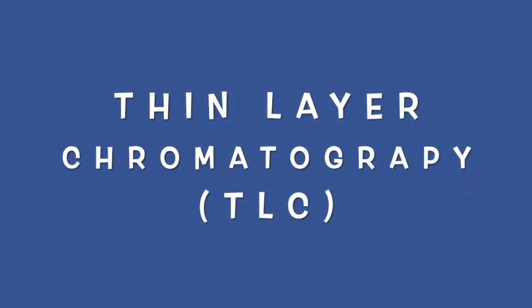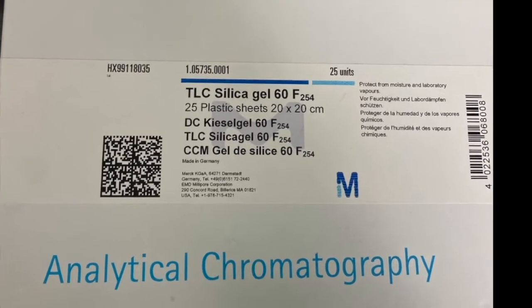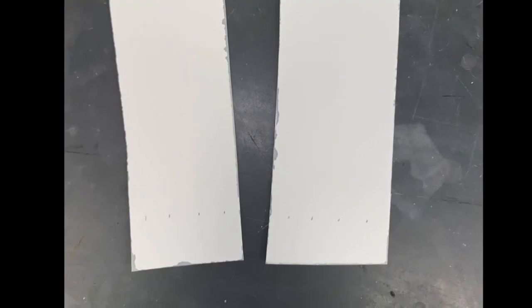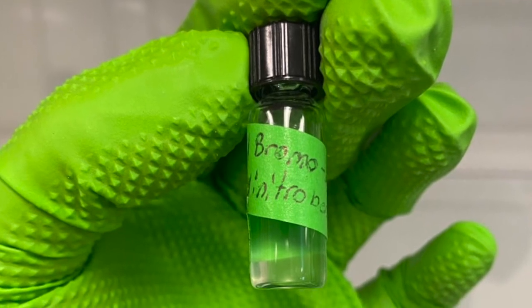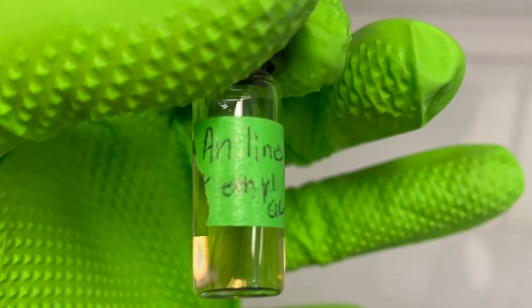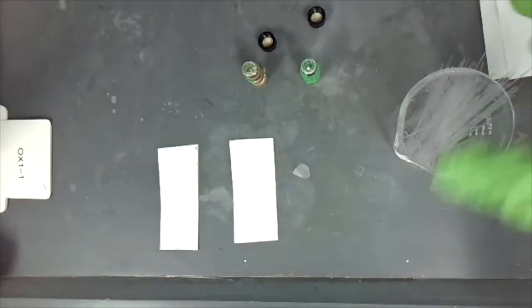Now we will do a TLC analysis of the product. To begin, you will take 2 pre-cut TLC plates and gently place 4 evenly spaced pencil marks about 1 centimeter from the bottom of the plate. You will be given a small vial that contains 1-bromo-2,4-dinitrobenzene dissolved in ethyl acetate and a small vial of aniline dissolved in ethyl acetate.